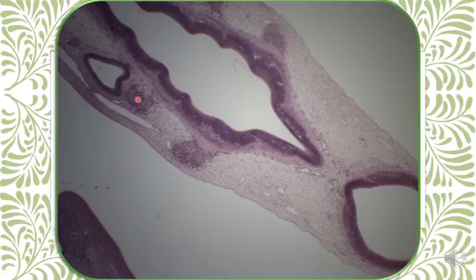More anteriorly, acoustico-facialis. This is called the trigeminal ganglia or semilunar ganglia.